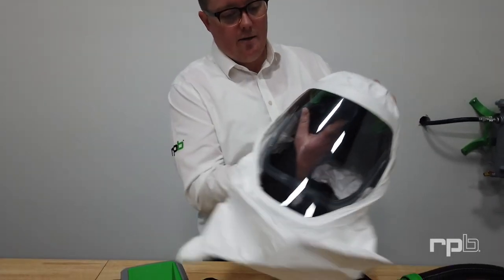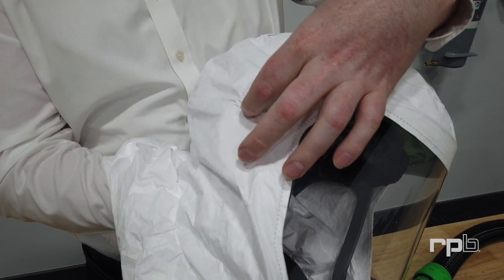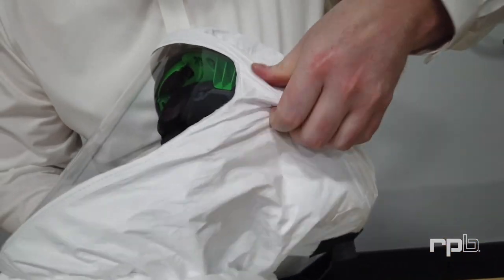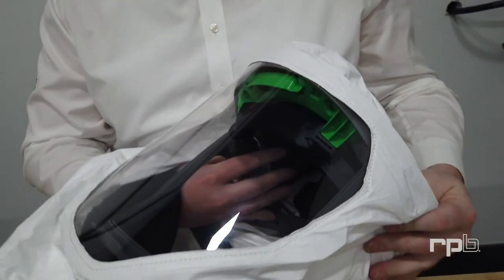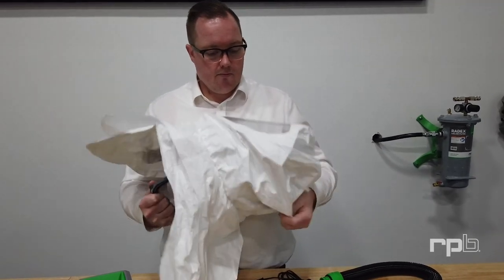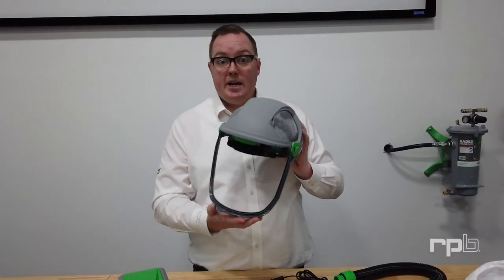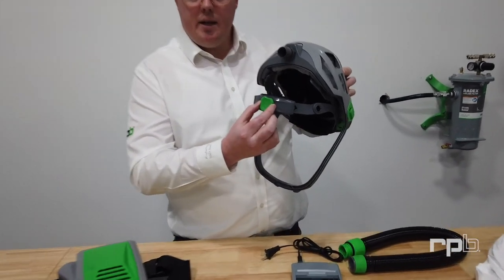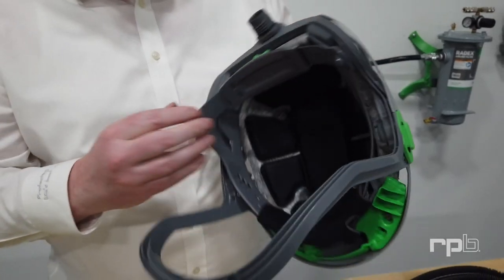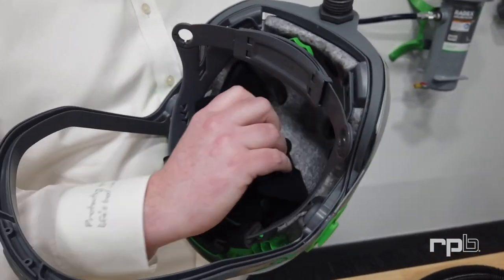To replace the outer shroud, locate the clips on either side of the T-Link, which are underneath the Tychem material. Locate the back portion of that clip and lift it up to release it from the T-Link. There's also a further video on YouTube that explains in detail how to unclip and reattach the T-Link shroud. Once the hood is removed, you reveal the main T-Link frame, which can be ratchet-adjusted to fit your head. The padding system on the inside can also be un-Velcroed and machine washed or replaced as needed.